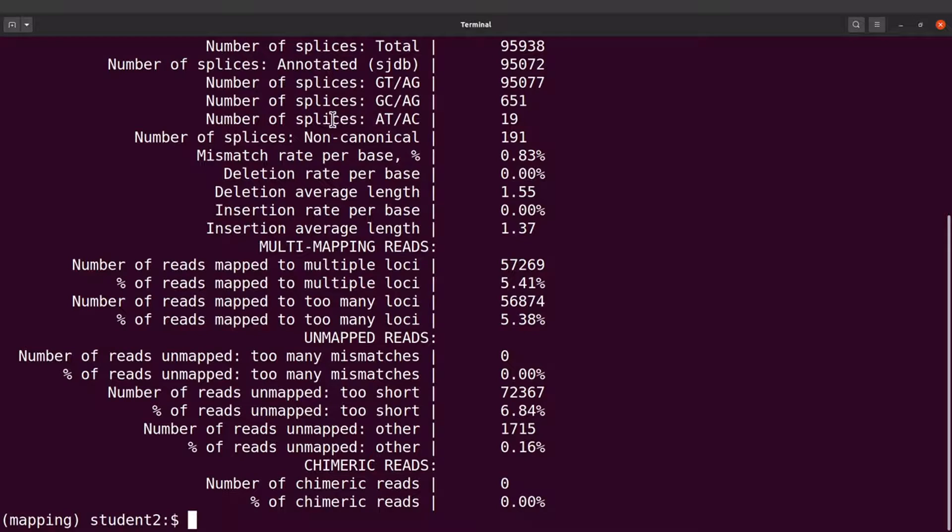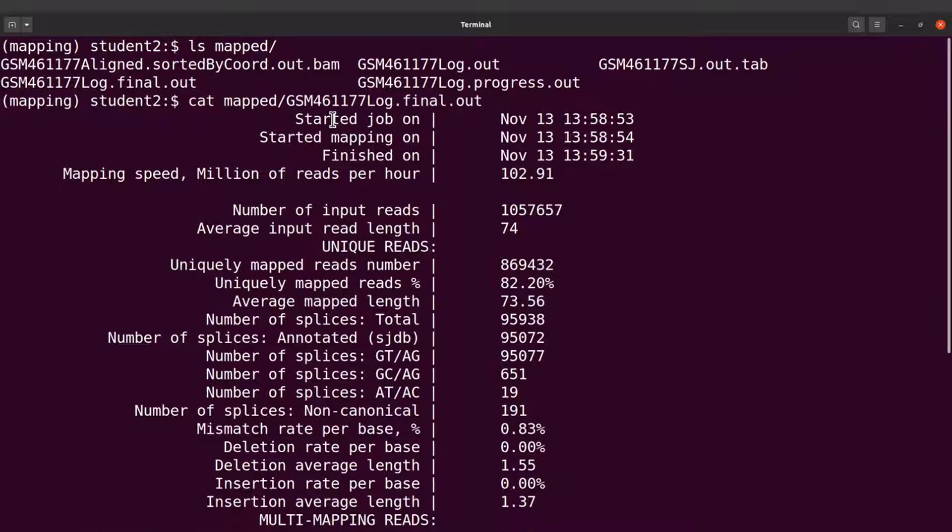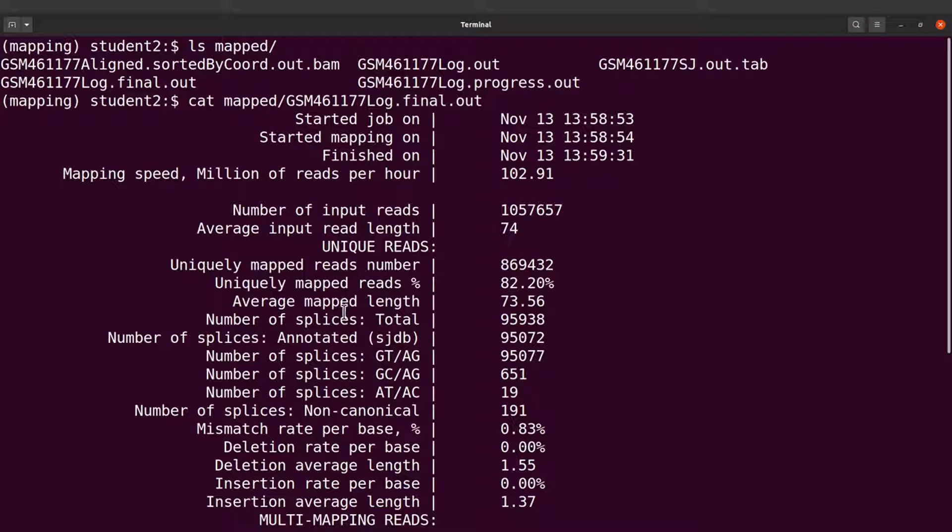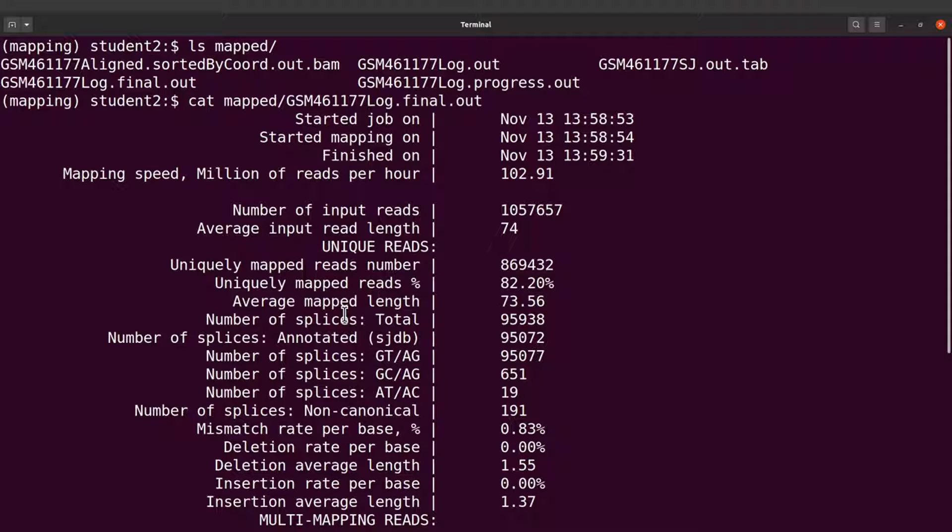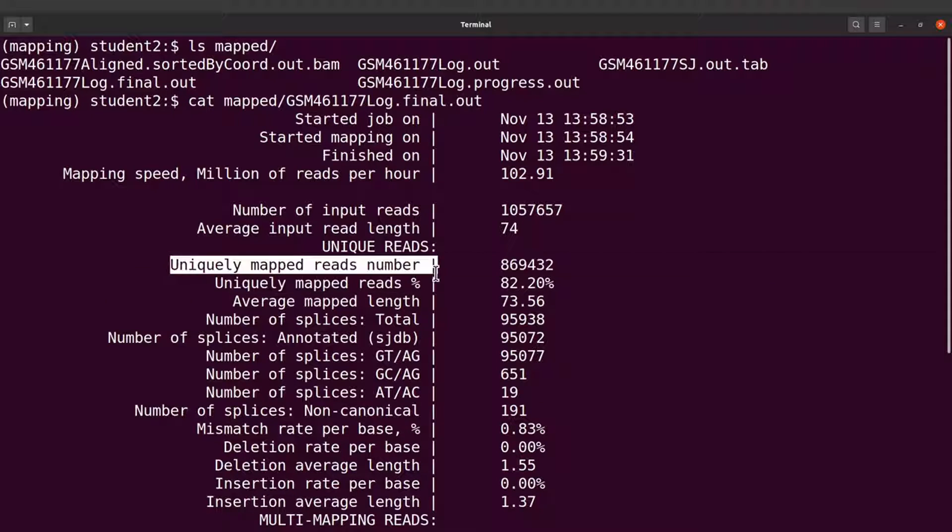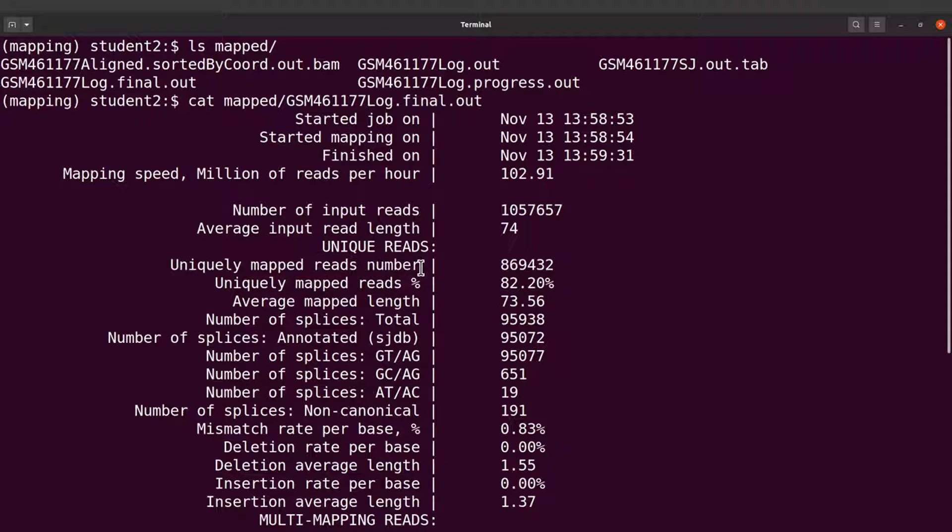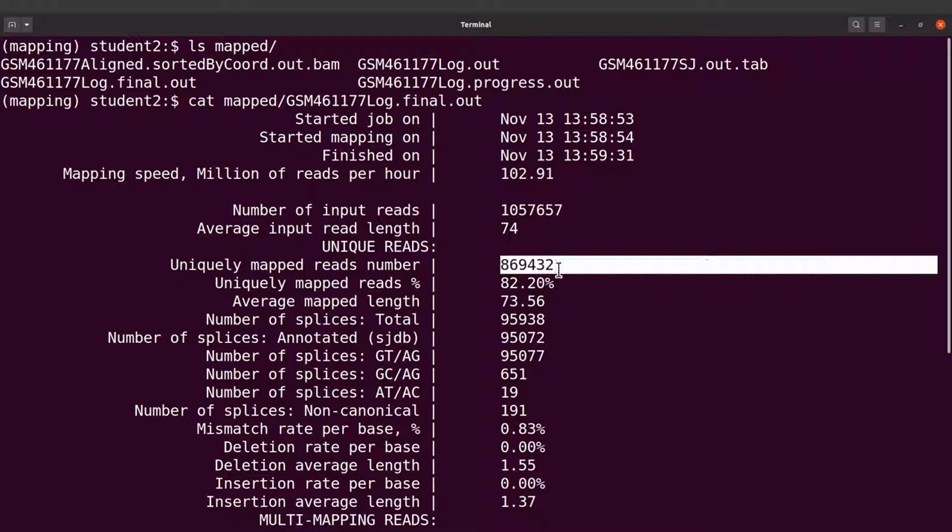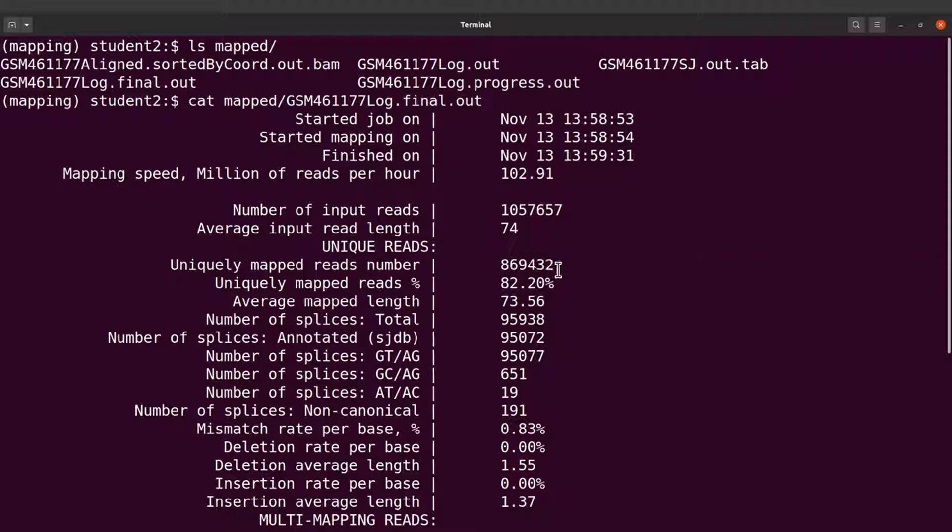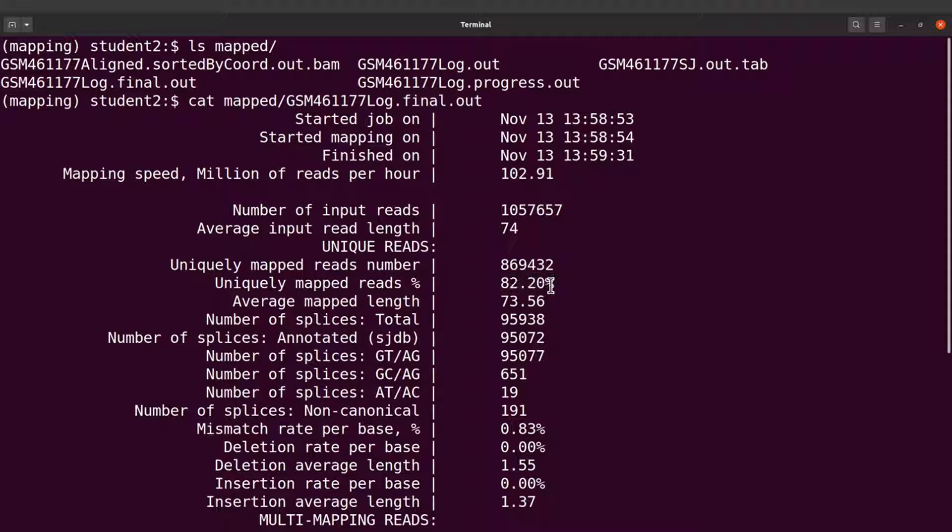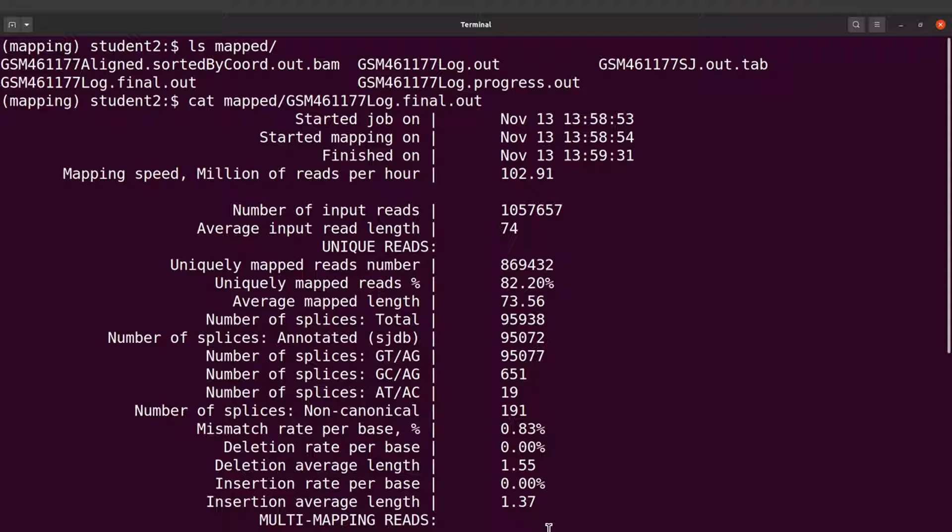Okay, the mapping statistics has been displayed for us. Whenever you perform a mapping task, one of the things you have to look for is the number of reads that's mapped to the reference sequence. Let's take a look at the uniquely mapped reads. This is the number and in terms of percentage it is 82.20%. Ideally we should have majority of our reads mapping to the reference sequence and that is what we've seen here, so things are looking good.